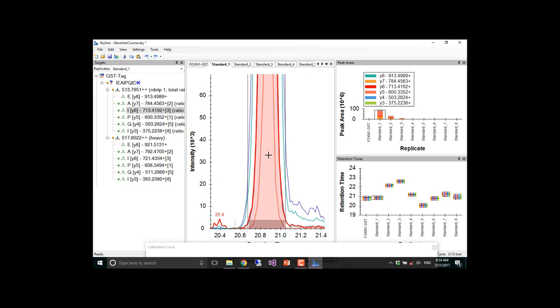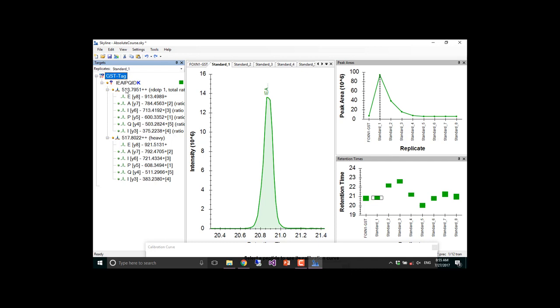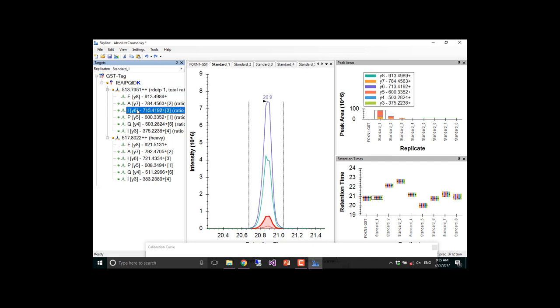Frequently it's pretty difficult to see the shaded part at this scale, even on the most intense peak. Which one's that? That's Y4? No, Y5. So you can maybe see a little gray there, but not really very much.